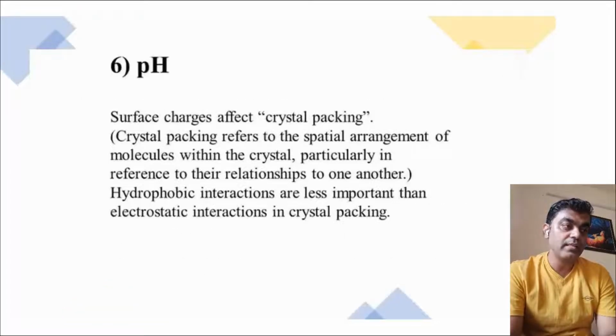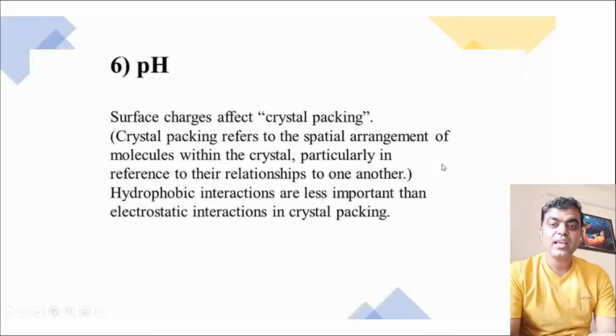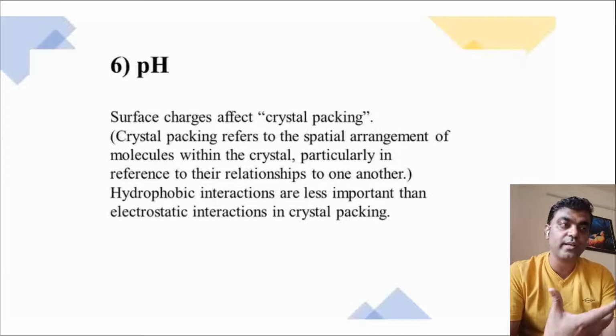And again, the pH. Crystal packing refers to the arrangement of the atoms or molecules in space. This is a spatial arrangement, and how they are related to each other in that space in a fixed conformation.